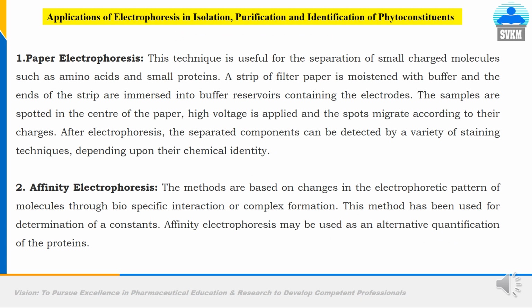Number one, paper electrophoresis. This technique is useful for the separation of small charged molecules such as amino acids and small proteins present in the plant material.